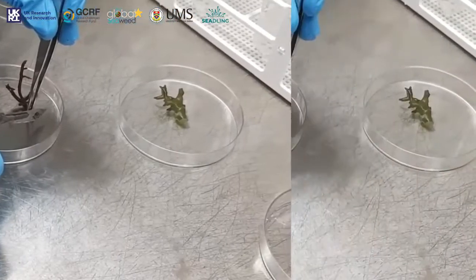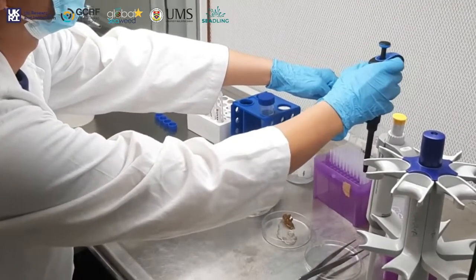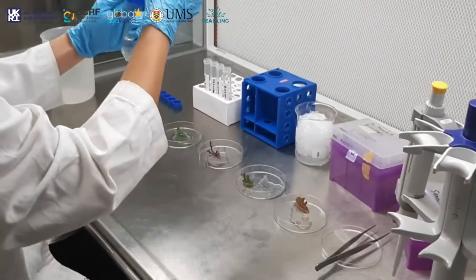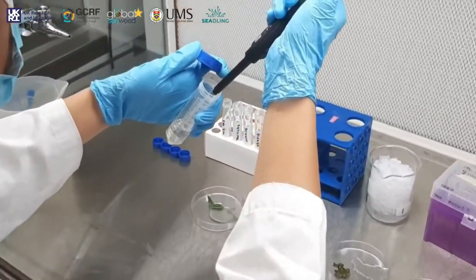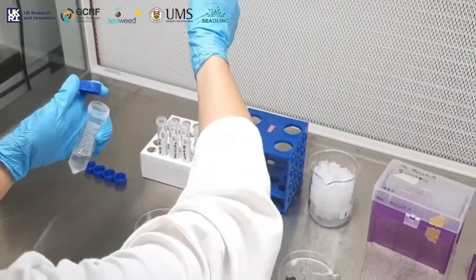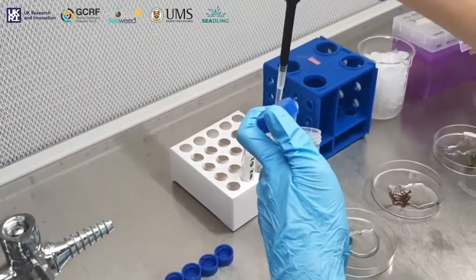Protoplasts are single cells which have the potential to differentiate into a complete seaweed. However, the isolation of protoplasts requires the usage of specific enzymes and buffers in order to ensure that the cells are released from the parental germplasm. The protoplasts are further validated using specific methods to establish their viability in vitro.